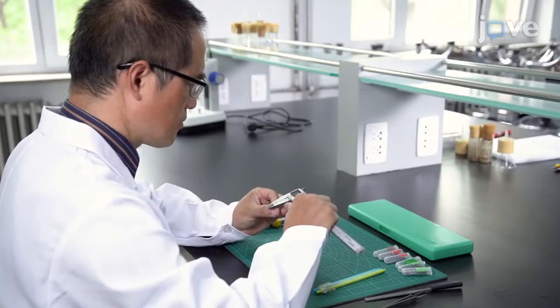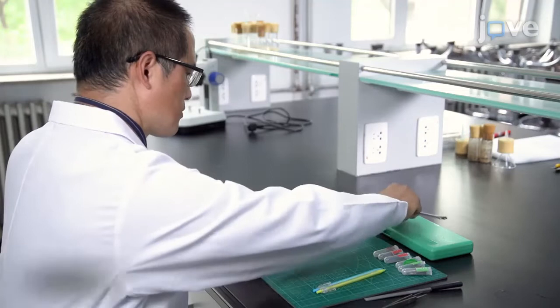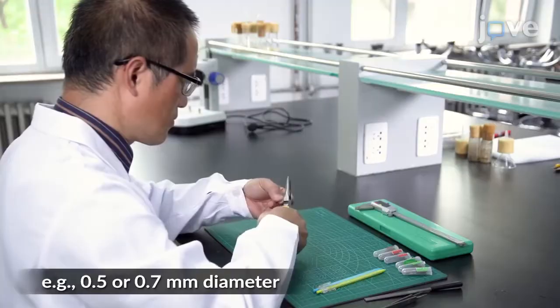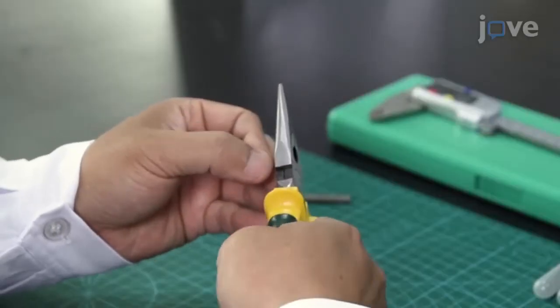To prepare the microdissection needles, select insect pins that match the diameters of the lead refills of ergonomic mechanical pencils, and use a pair of pliers to cut off the wide ends of the pins.